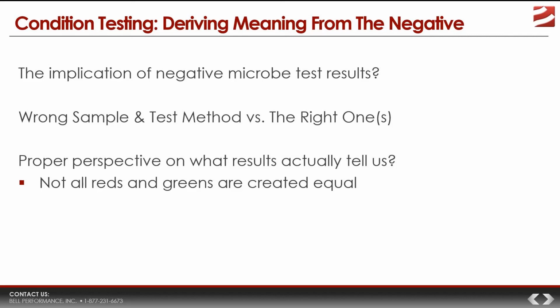The ATP test is giving us a total microbe count. But not all microbes are equally problematic, right? Remember earlier we talked about having manageable levels of microbes as our working goal. We said that whether a given level of microbes was a problem would depend on what the levels were.